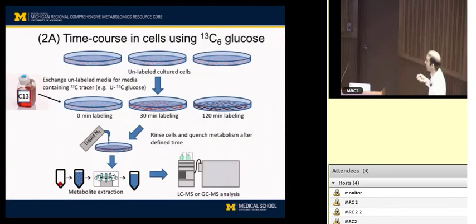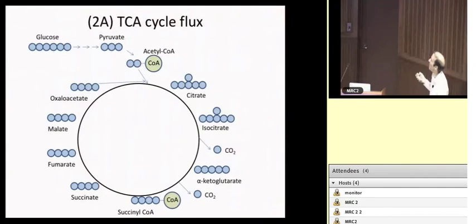So we can go through that relatively quickly. And then you're going to quench your cells to capture metabolism, do extraction, et cetera. And then what happens? Okay, well, Teresa already showed you this in detail, but I'll click through because animations are fun. So you label your glucose.